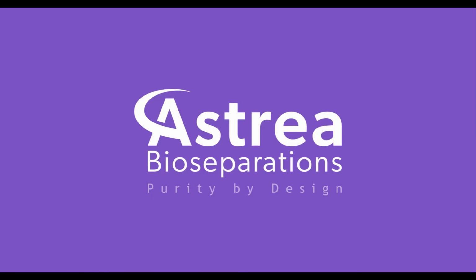For the GMP ready columns, what we standardly do is set up a packing development plan where we create a robust packing method and then supply that over to our Isle of Man facility to complete the robustness packing to develop the GMP ready columns. We normally see approximately 6 to 8 weeks for our packing development, and then around 6 to 8 weeks for the GMP ready columns. Now, again, that is for materials that we have not ever packed before.